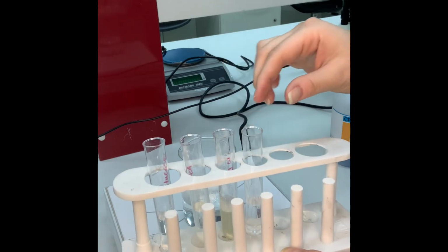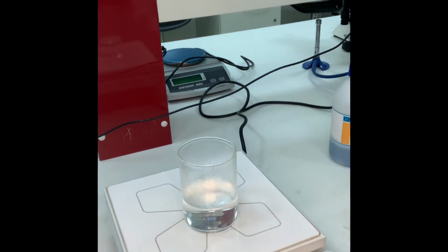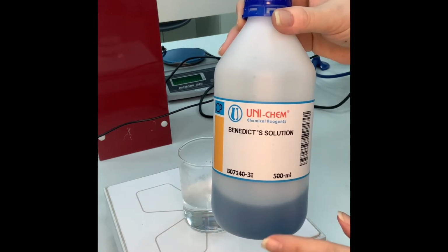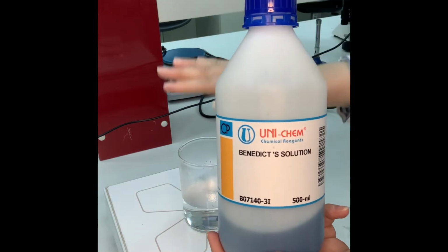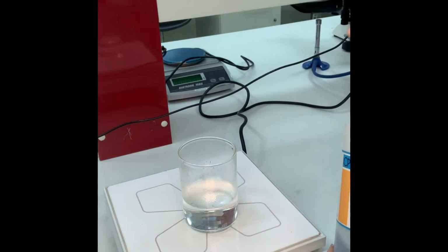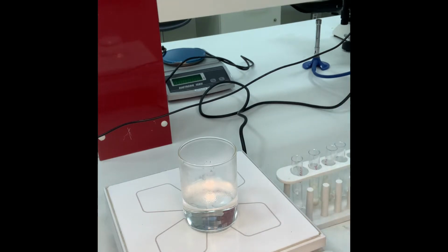So I will add Benedict reagent. This is Benedict reagent. It's blue colored. I will add it to all 3 test tubes and I will apply it over here, okay, for reduction. I hope it is clear. I don't have enough time for my video to picture everything.